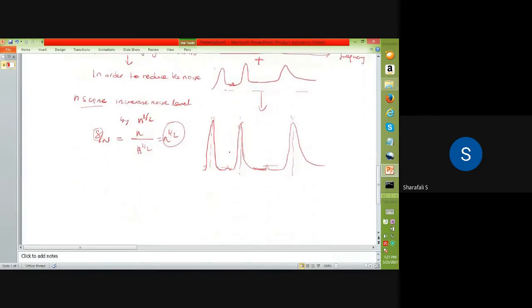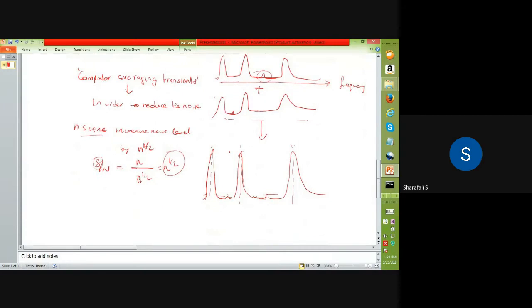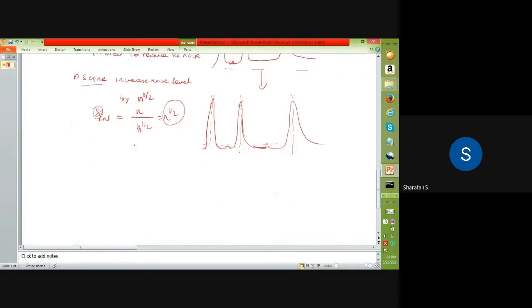Also, the removal of a signal is done in the same way, but there we subtract one signal from another signal. As we discussed before, if you are using a solid sample with paraffin oil and you want to remove the paraffin oil peaks, then we can do that if you are using a computer system, by subtracting each and every point of the paraffin oil spectrum from the combined spectrum of paraffin oil and the solid.